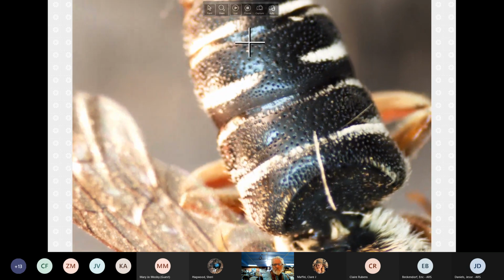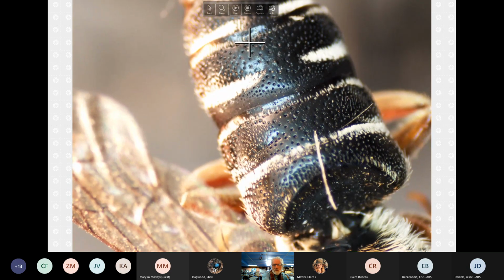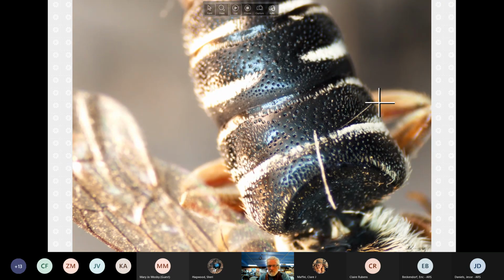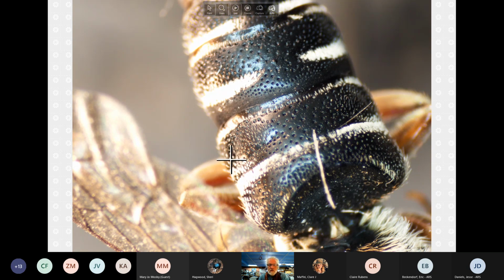So I'm pretty sure that in the guide it said there was no fovea here, and you see that we have this fairly uniform pitted area. This is where the fovea would be. I don't see anything. I see less ruggedness in general, pits further apart. This is just the vibe of this particular group. T1, T2, here's the lateral groove. This is very nicely seen here. Disappears. So there is no groove through the middle there.